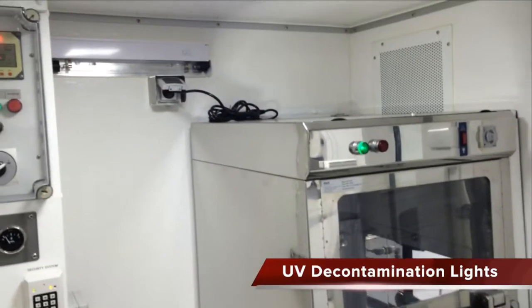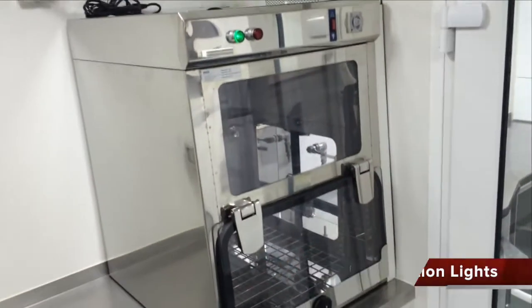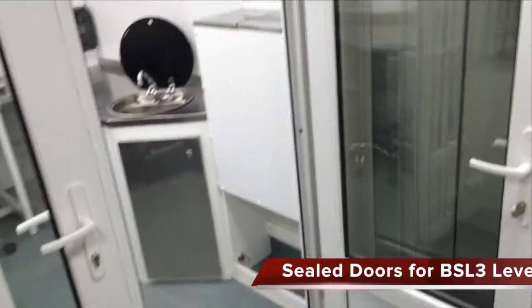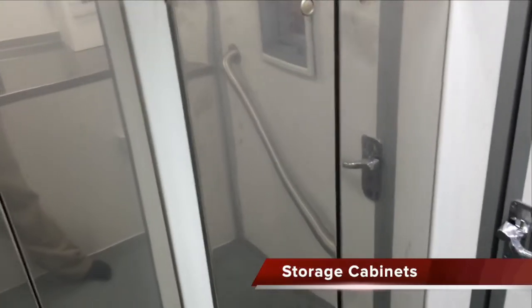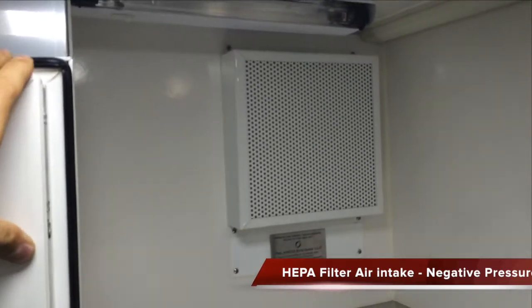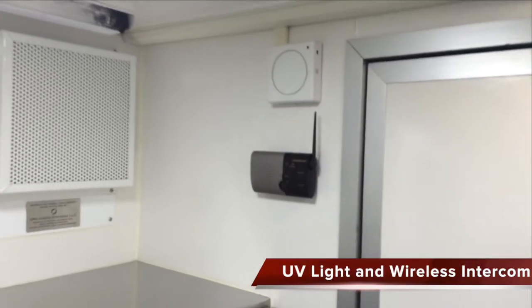Here we have the UV lights and the pass-through box with UV light inside. The walk-through here, the door. The system of stainless steel cabinets here. There's the air entry for the HEPA negative pressure system. Another UV light. Intercom system.